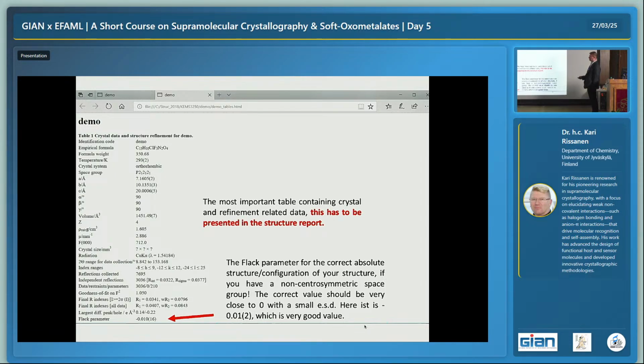So this is now the first time the density appears. And this is, remember, the idea, it's mass over volume. It can then calculate this density when we know all the atom types. And now this mu here, this is the absorption coefficient, which tells us how strongly atoms in the structure absorb X-rays.